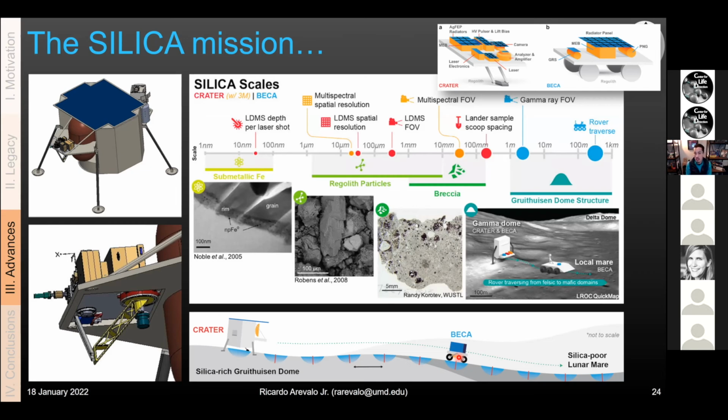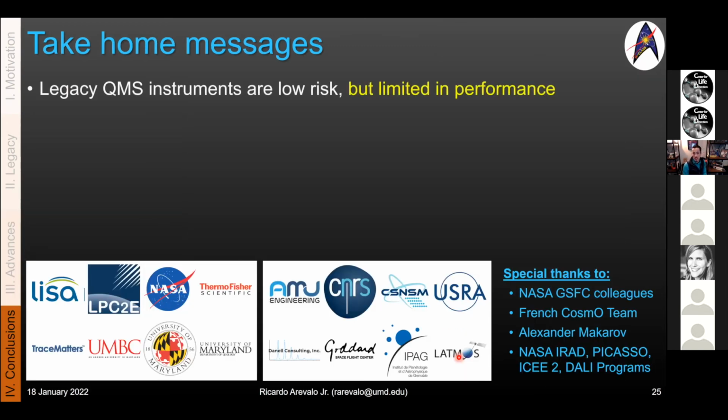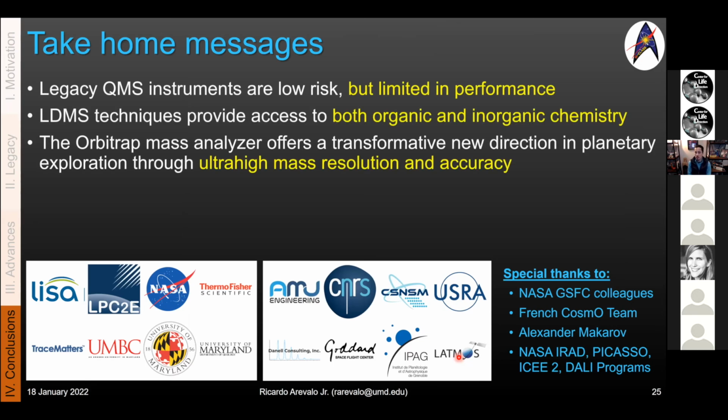It has astrobiological implications, but it shows that LDMS techniques aren't just limited. I don't want to say limited, I hate that word. They're not pigeonholed to looking for signs of life. It's certainly bread and butter for LDMS techniques, but because major rock-forming elements have ionization energies at, or in some cases below, many biosignatures, we get that information for free.